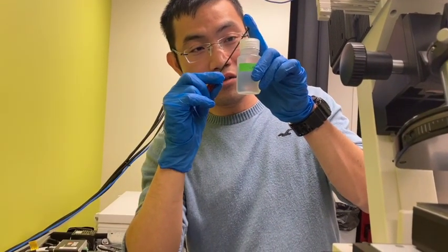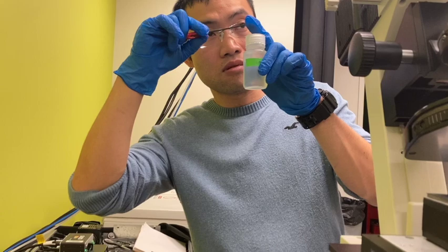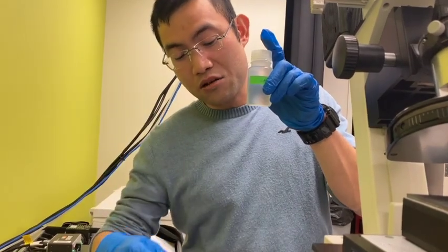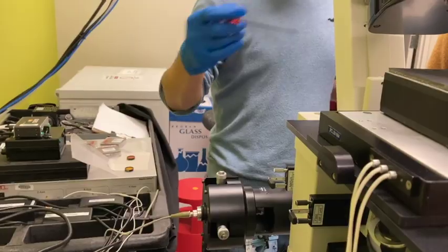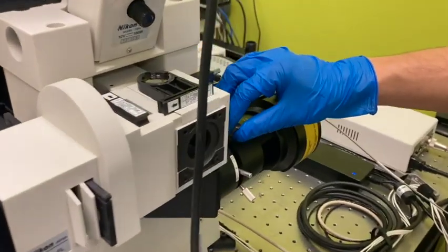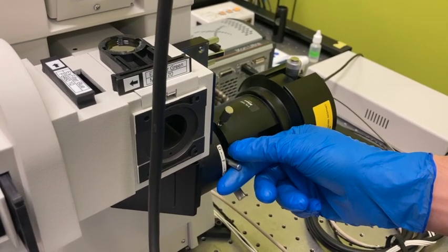And you can go a little further out. In that case, you're going to decrease the penetration depth. But yeah, that's how we have our TIRF. And if you go in this direction, there's another aperture to change. We have this, and this is the aperture. So this is actually the field diaphragm.